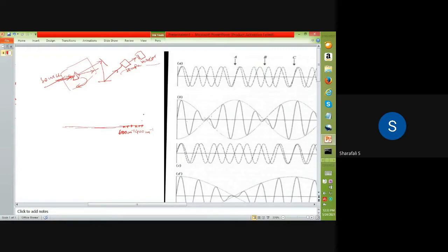So with this frequency, we will measure what is the transmittance. So if, for example, when you consider that 400 centimeter inverse, which means that associated with that 400 centimeter inverse, we have one frequency which is coming from the source. That is dispersed by the prism, and which is coming from this mirror and going through the sample. And if there is no frequency of vibration in the sample associated with that frequency, then all of that frequency will be coming out and detected by this detector.